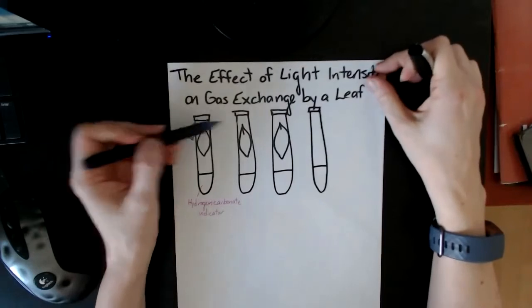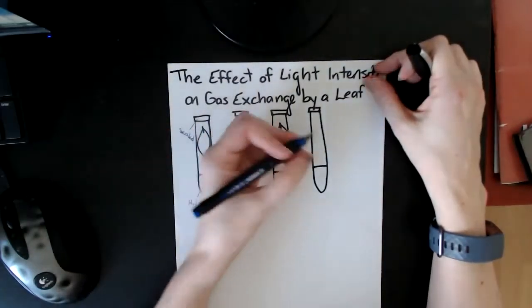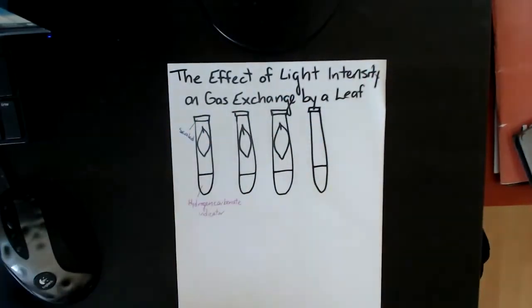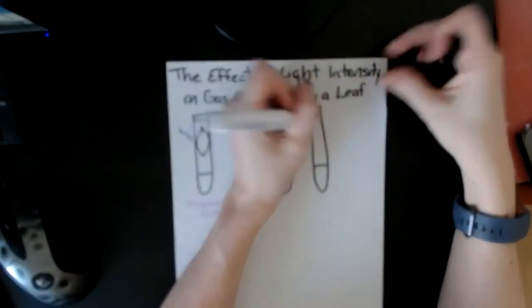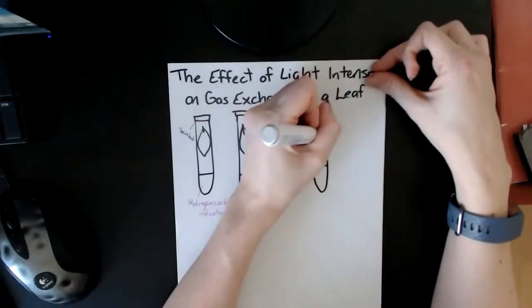So there are my other test tubes. Three of them have leaves in them and the fourth one doesn't have anything. They're all sealed. This one here is acting as a control because it has no leaf in it, so there's obviously going to be no gas exchange. So this is your control tube.